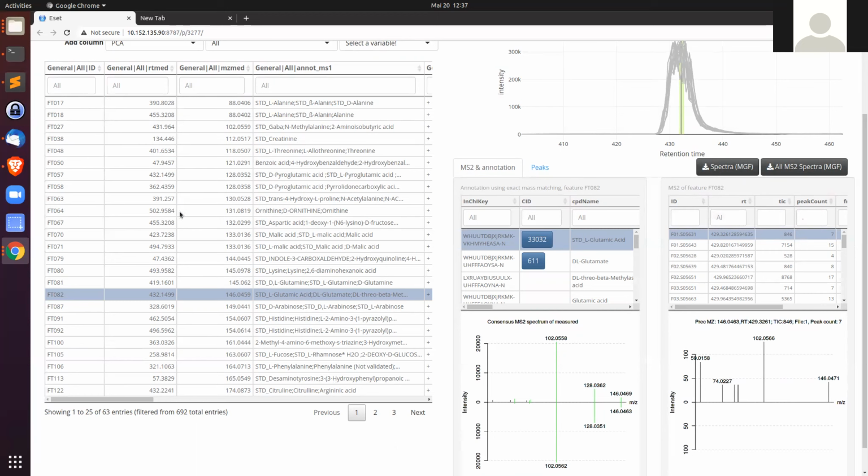You may notice that for some of the annotations here, we have the letters STD and a score. This is something special for our BioMS annotation. We have measured many pure compounds. We know when each compound will elute from our LC system and how it will fragment in our MS. So in most cases when we have STD, we have a higher chance of a correct annotation.